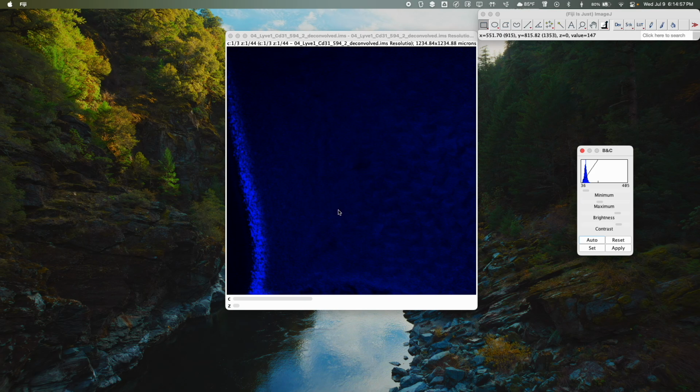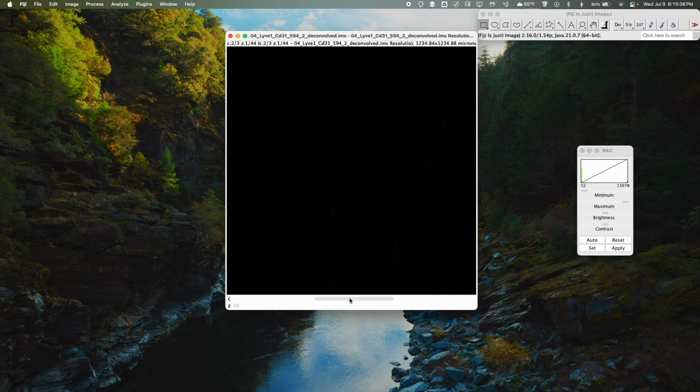So my guess is, the villi with the lacteals inside hanging off to the side. So my guess is that this will likely be an image extraction. So we're only going to need the green channel in this case. And let's just make sure.